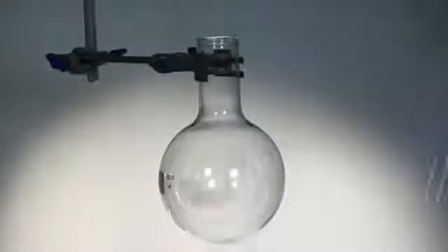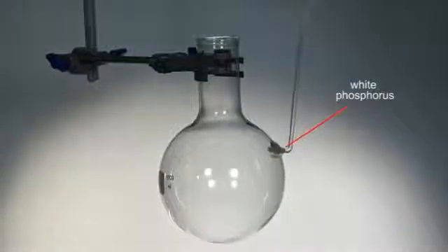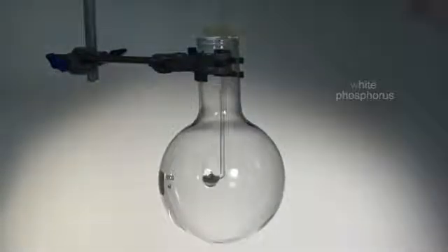A piece of white phosphorus is dried and placed in the glass deflagrating spoon. The element is then lowered quickly into a flask of oxygen.